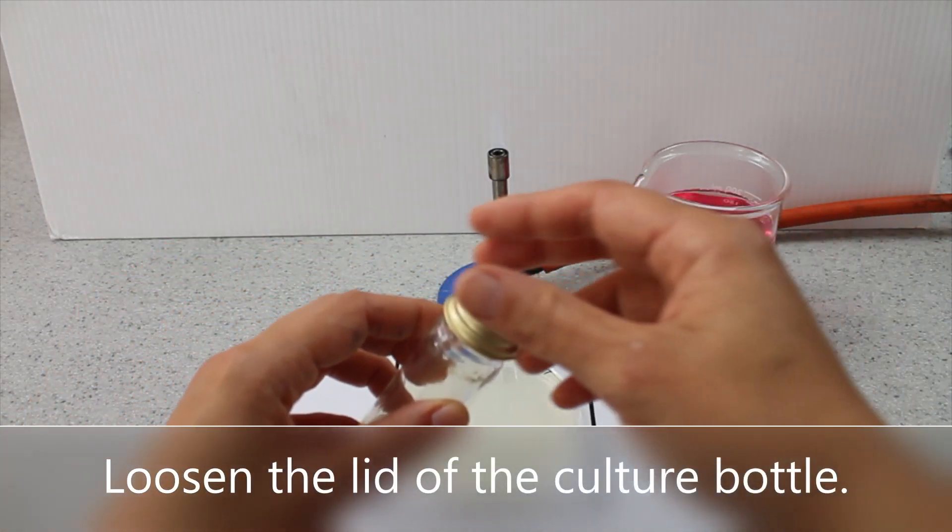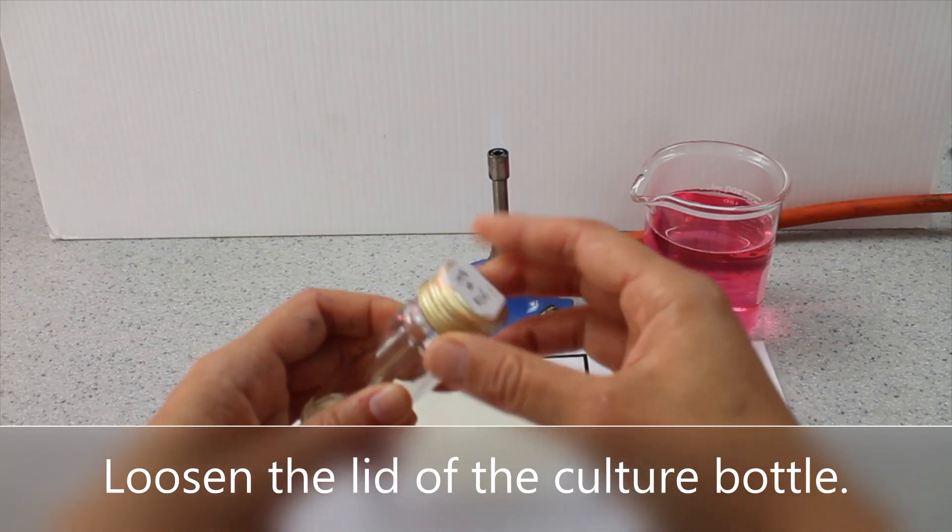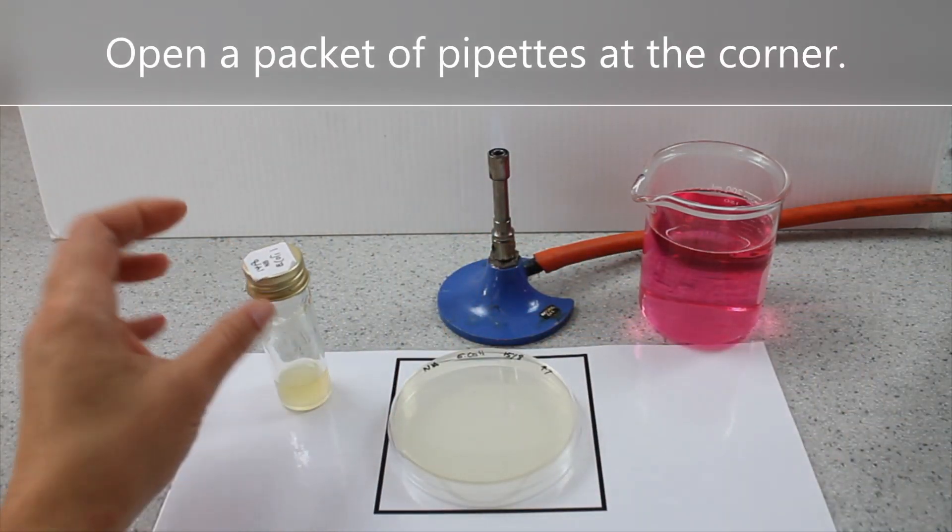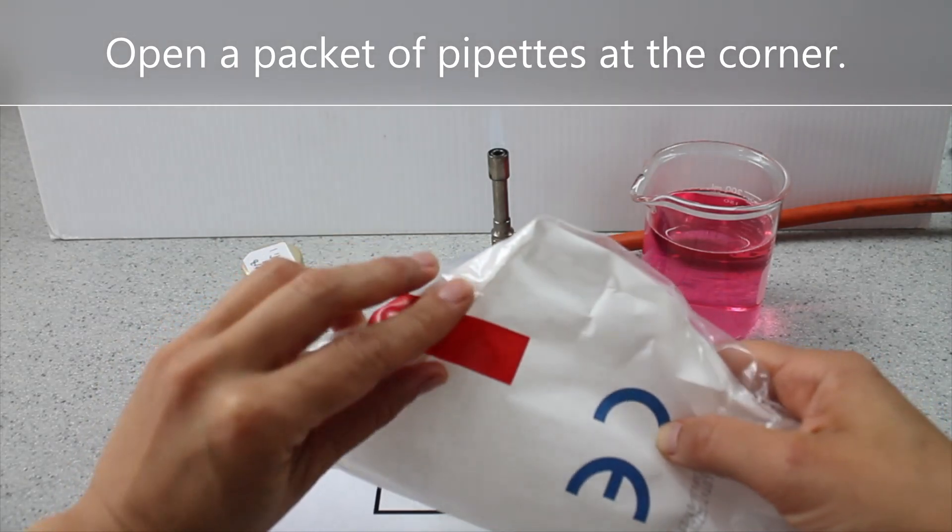Loosen the lid of the culture bottle. Open a packet of pipettes at the corner.